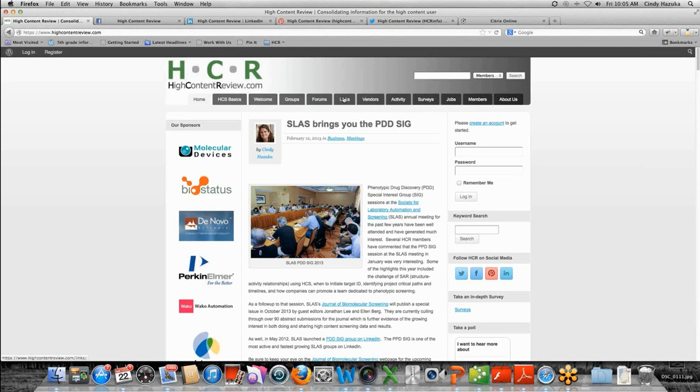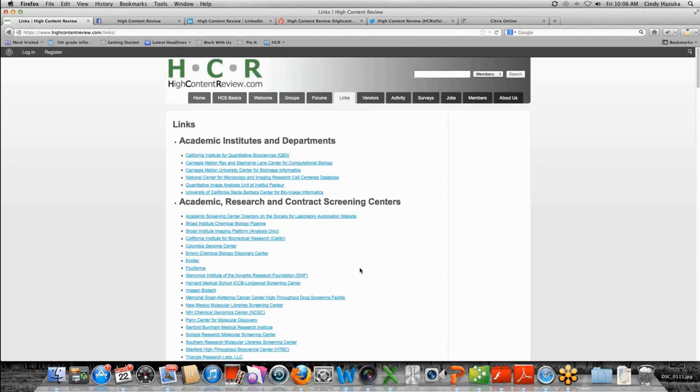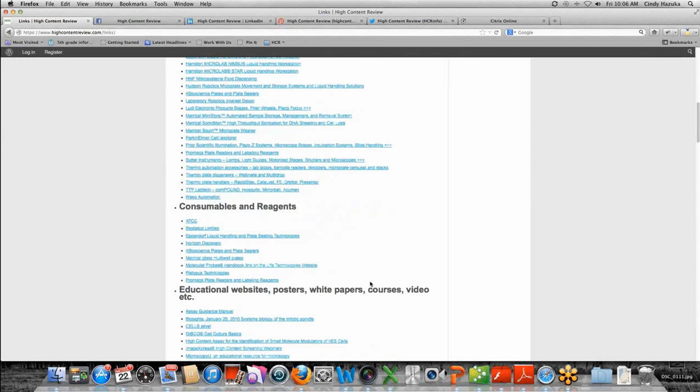I think right now one of our best resources is on our links page. Here, what I've really been doing for the past year is trying to consolidate links to anything people might be interested in terms of high content screening. And it's all organized by category, things like academic research departments, companies that are involved in automation, consumables, education.